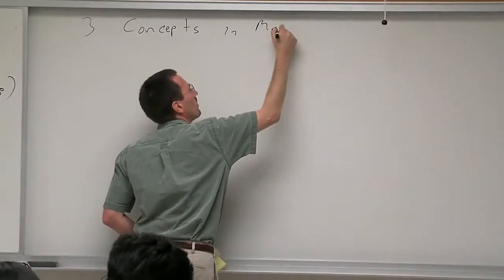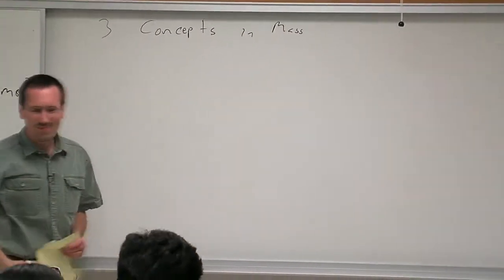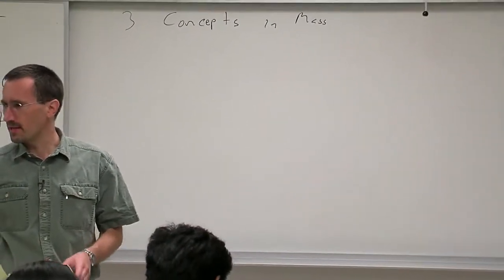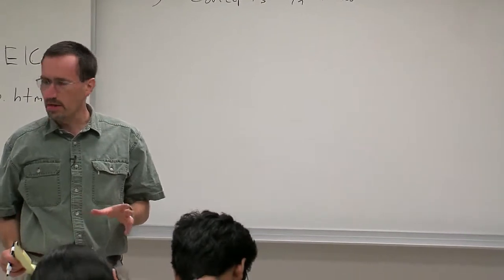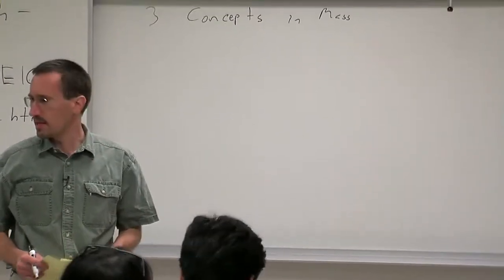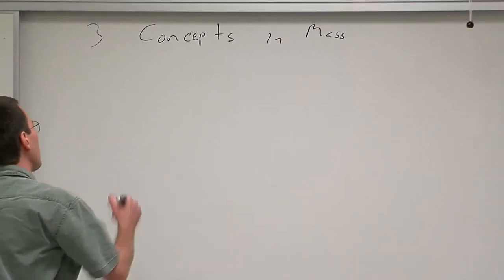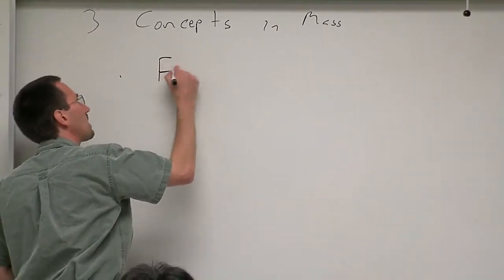in mass spec really aren't very hard. And in fact, nothing is hard about mass spec except we think differently than we've sort of gotten used to thinking as organic chemists. So the first concept is exact mass.